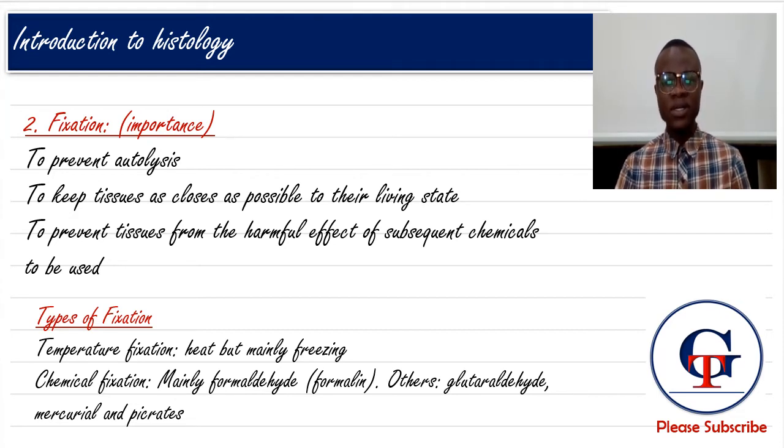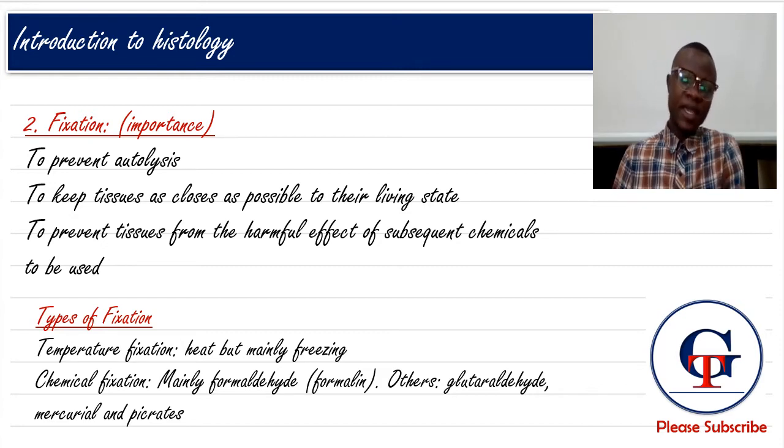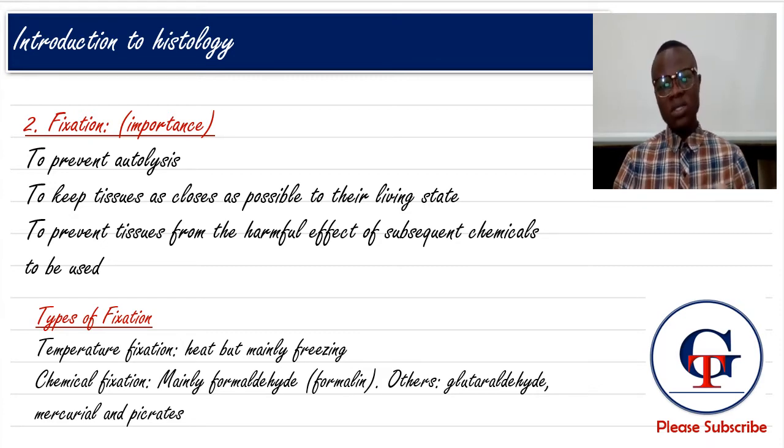And when that happens, the cellular content, that's lysosome and other organelles, are released generally into the tissue, and they will cause the destruction of surrounding cells and generally change the morphology of the tissue as compared to its normal state in the human body or the source that it was gotten from. So we do this to prevent the rotting of tissue.